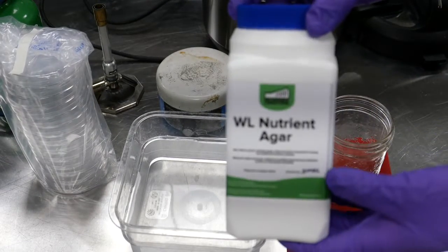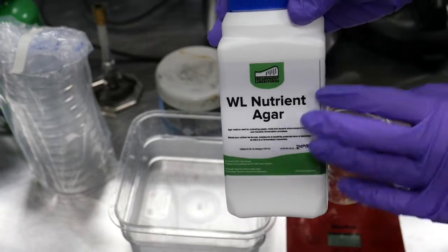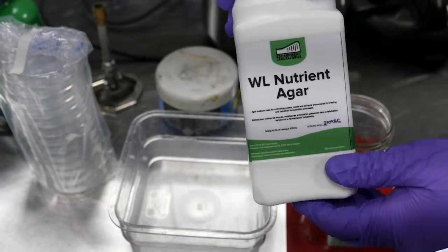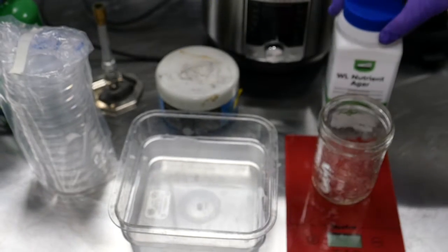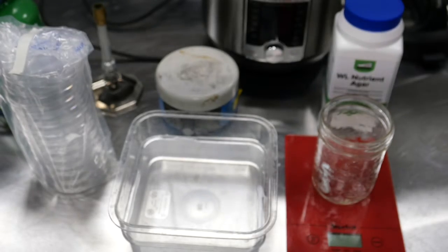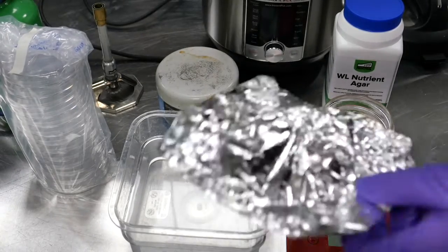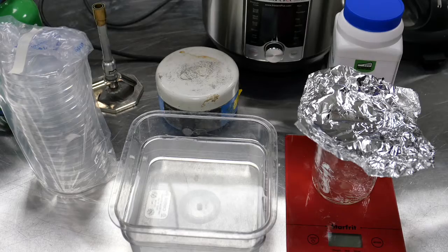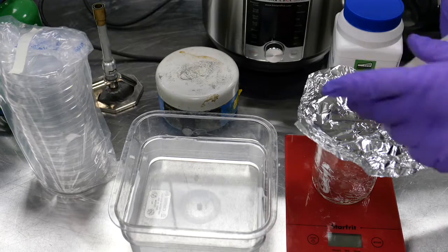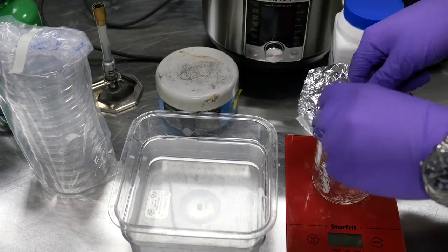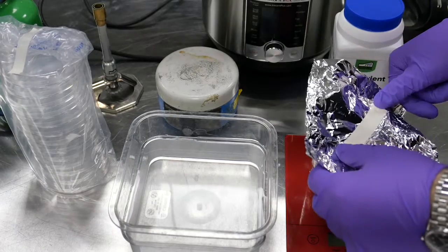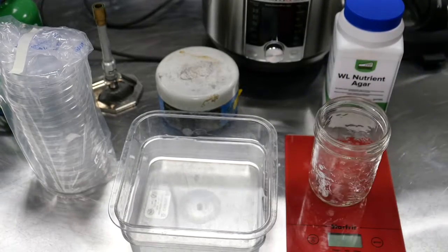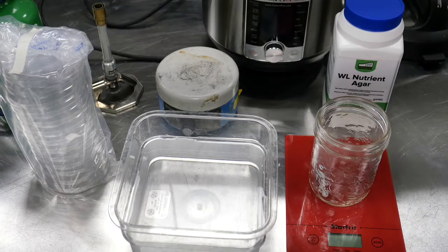You of course need your agar medium as well, so this is all pre-mixed. It comes with instructions, everything ready to go. And then if you like, you can also have some foil and autoclave indicator tape that will turn dark when it's been heated and pressurized. That's all it takes, so let's get into it.